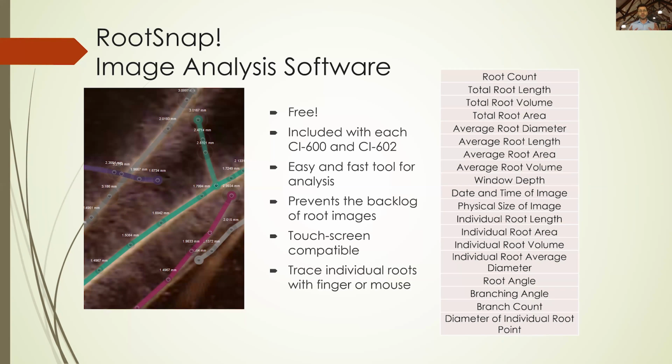But the scanner itself is really just for scanning and making sure you can do it out in the field. It is connected to a tablet that we do provide, and we'll show it in a little bit. The tablet comes with the software for scanning, calibrations, as well as our RootSnap image analysis software. This isn't to say that only the tablet can run it, it's just what we have found to be the handiest when you're out in the field. The image analysis software can be put on pretty much any computer, as well as the scanning software.